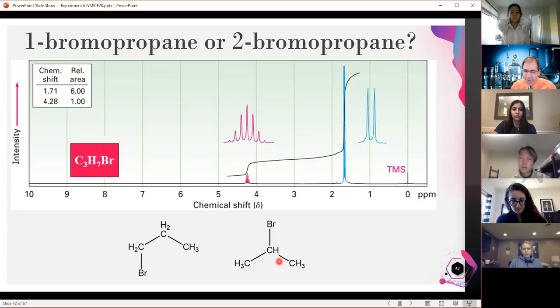All right, 2-bromopropane. Yay! Thank you for the 3 of you who were brave to start with it, or more than that. You are correct. So we can actually get to this multiple ways. First would be number of signals. And there's 2 signals here.